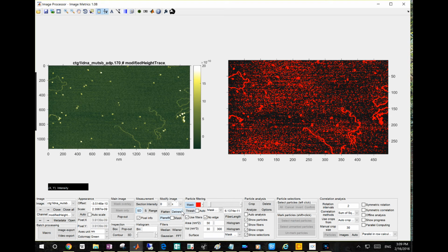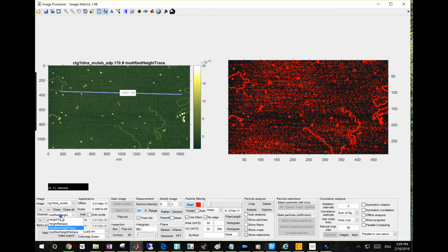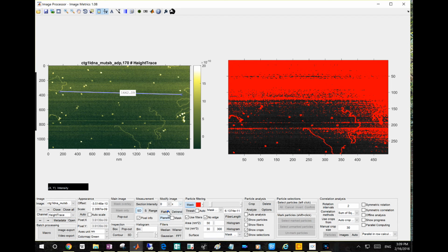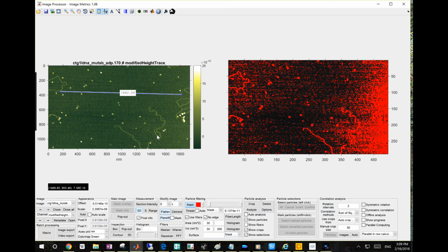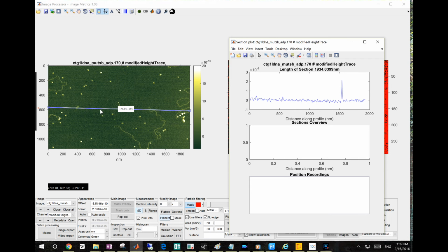And you can also do a detrend, which, if you have a section line and you just want to flatten that profile line... this is not a good example because it's already flattened. So let's go back to the original image. Yes, this one. Let's flatten this again. Let's just do this channel again. So make sure it's in that specific spot where the surface is warped, right?